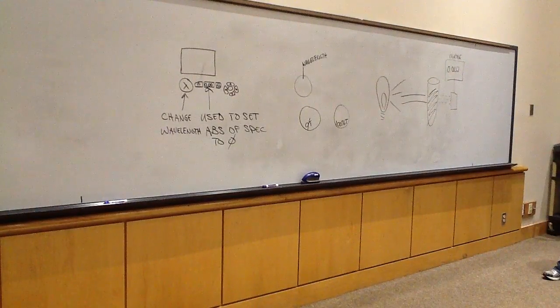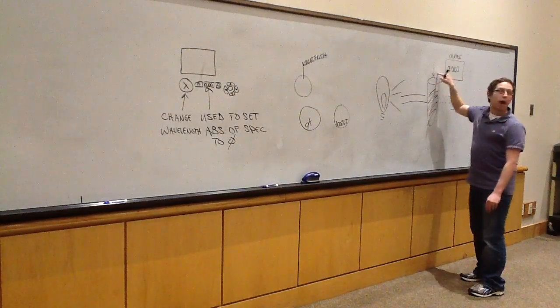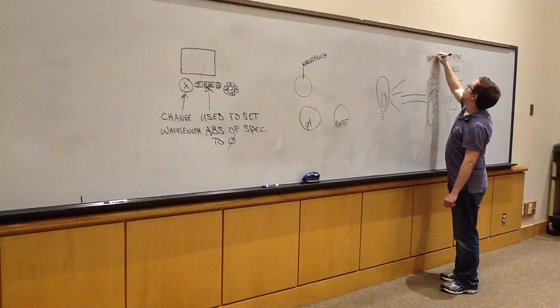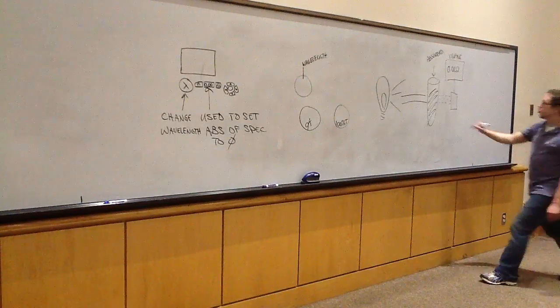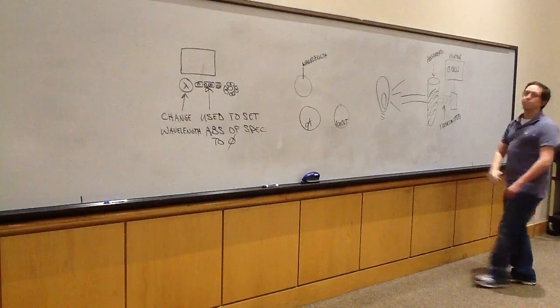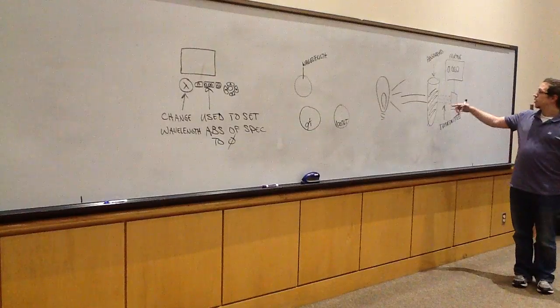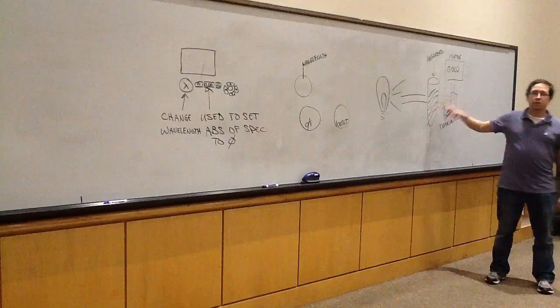Okay? So, whatever light is trapped by the tube and the substance in that tube, that is the light that's being absorbed. Whatever light is passing through, that is the light that's being transmitted. So transmitted light is light that passes through the sample, and light that's absorbed is light that doesn't pass through the sample. It's trapped by whatever the substance is.